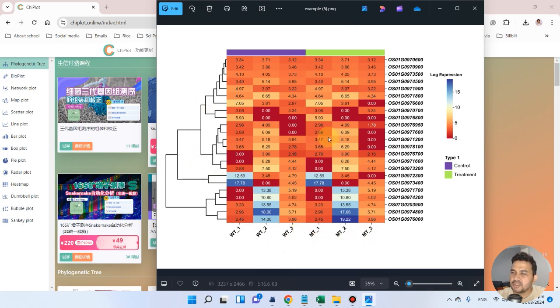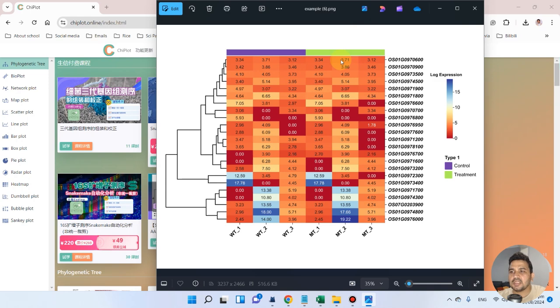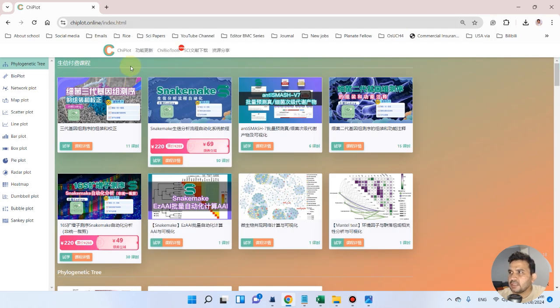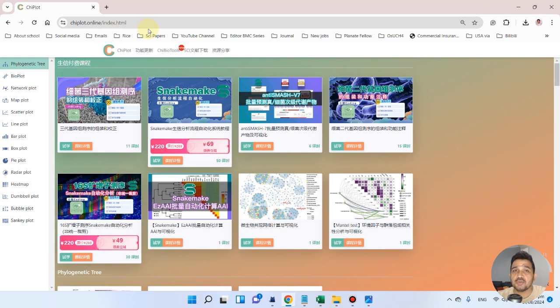We have clustering on the basis of gene expression, and we can also have distinction between the three replicates of wild type and the three replicates of mutant type. So let's dive into how we can draw this heat map using the gplot website.